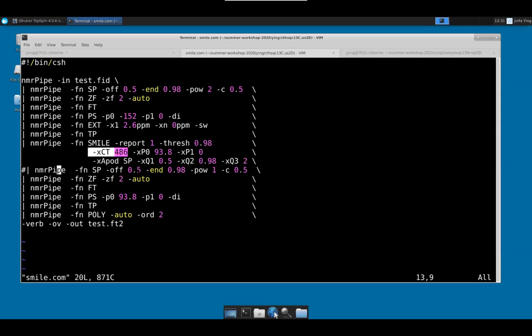If you need more resolution, I say yes. If you need a linear prediction, I say yes, do this instead of linear prediction. But I tell you what, if some peak is not resolved in your spectrum, it's unlikely it's going to be resolved. So it's good for something that is already resolved, but you want to make it narrow so that they resolve better. Look better. Not just look better, also more resolved, right? Okay. Yeah, look better too, of course. That's important too.